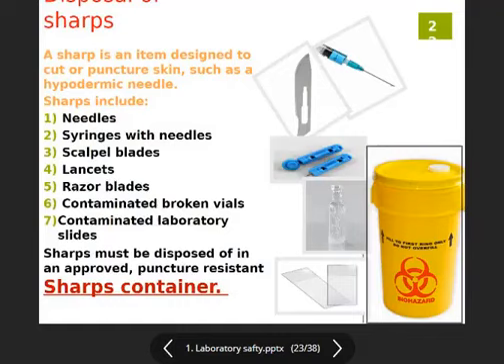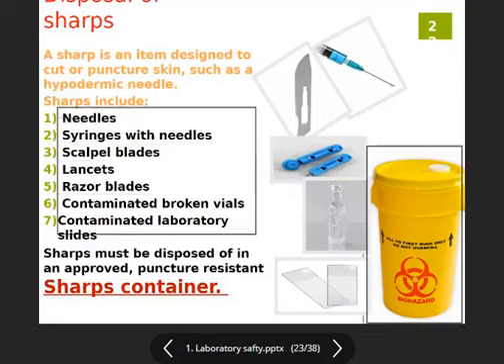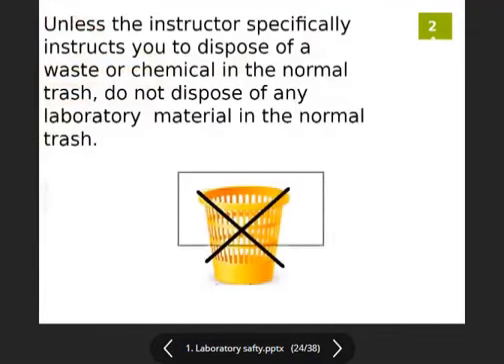Okay, so all the syringes and sharp objects, you will put in this basket and not in this basket. This is not for sharp objects. So you should know how to dispose of sharp objects.